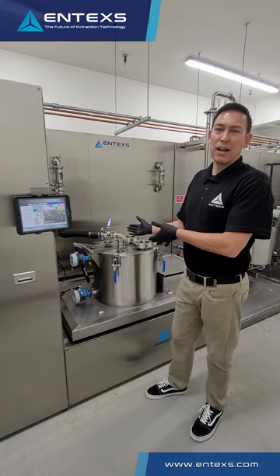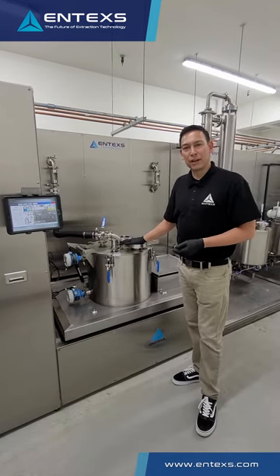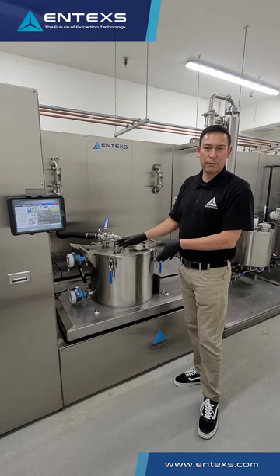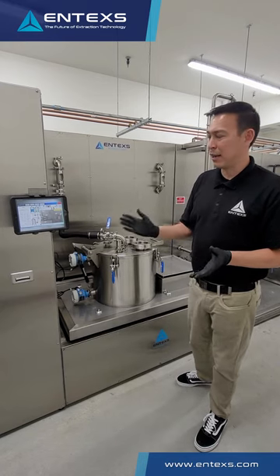This is the Entex extraction module where the process starts. This piece of equipment is the extraction centrifuge. This whole system is built in-house. We build the centrifuge, the sealing elements, the rotating equipment — everything is designed in-house by our engineering team and built in-house as well, machine fabricated.